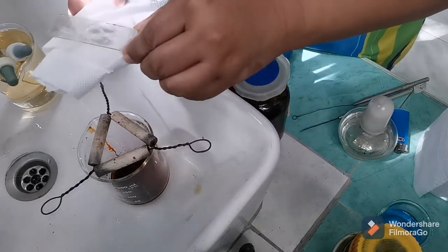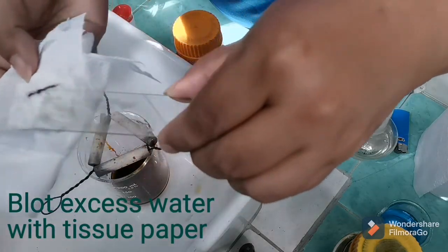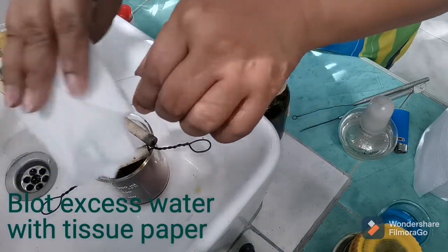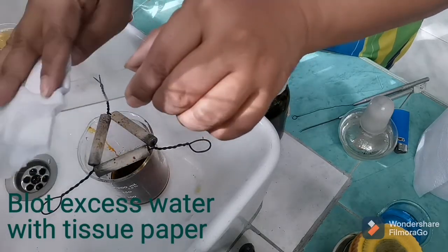You can again get your tissue paper. If you notice, there is already a smear that is fixed on it. Just simply blot in order not to remove the smear.